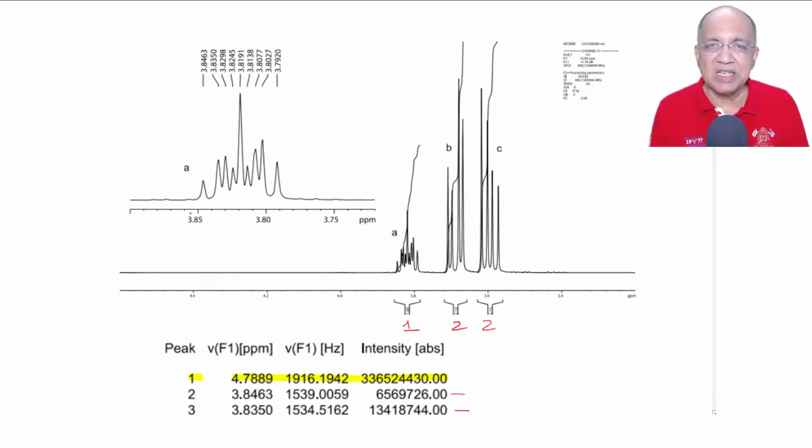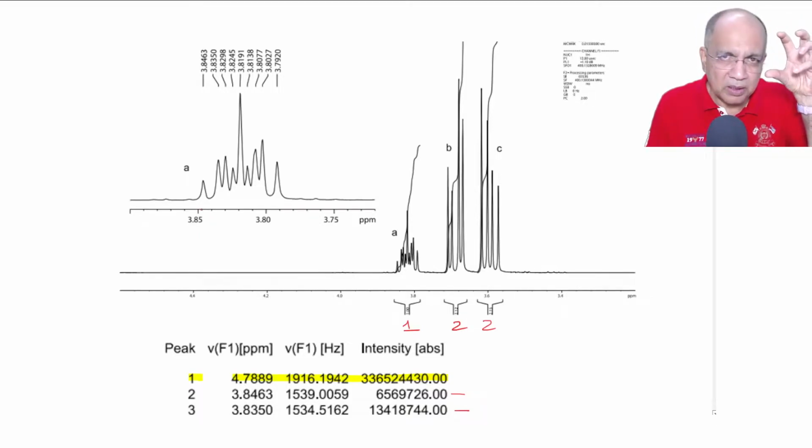Otherwise DT or QD won't give you 9 lines. So triplet of triplets looks a little weird unless we see it more carefully. We can't find the proper 3 triplets, right?